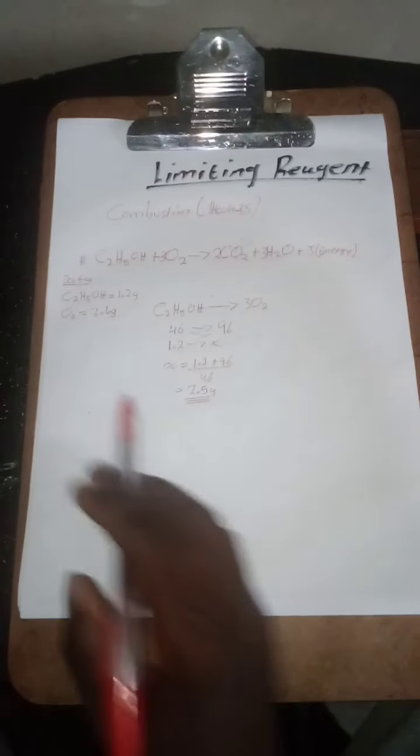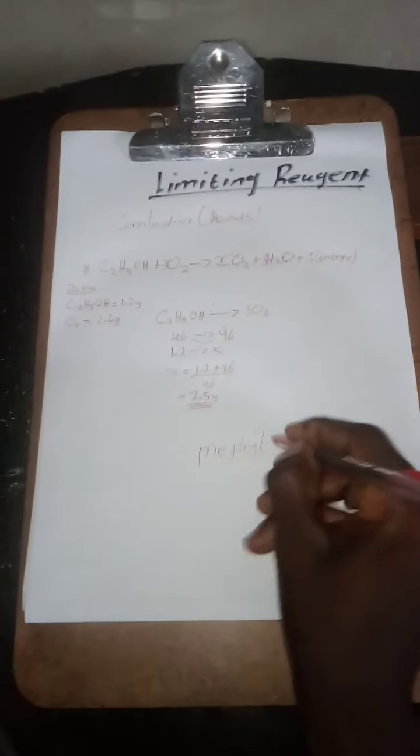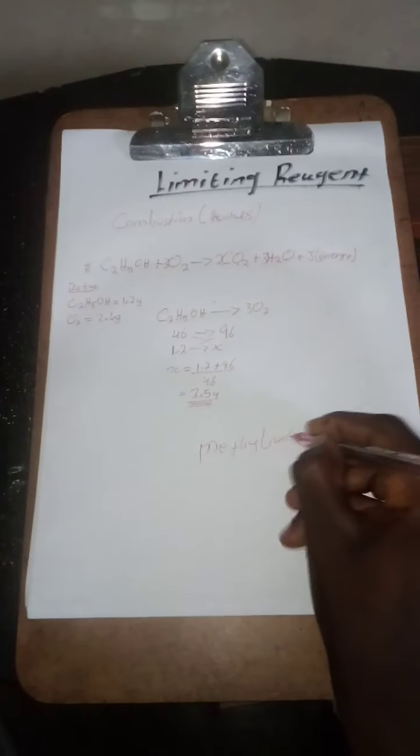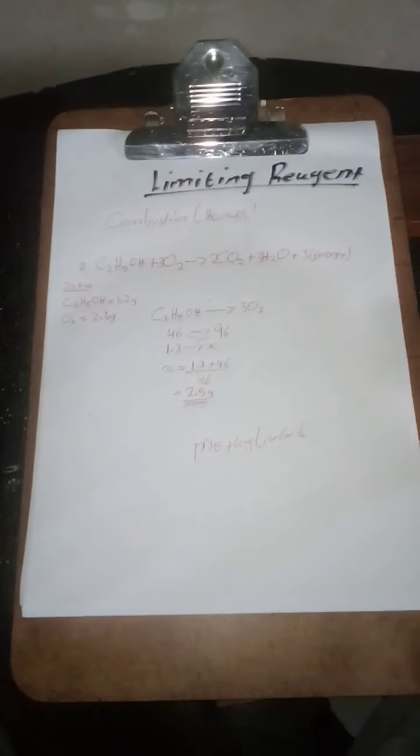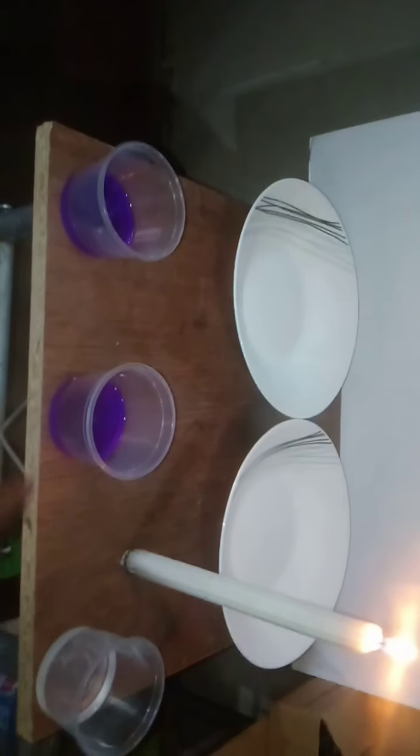What I'm using here in an experiment is methylated spirit. This is the methylated spirit. I've put the same quantity, and what we have here is water.